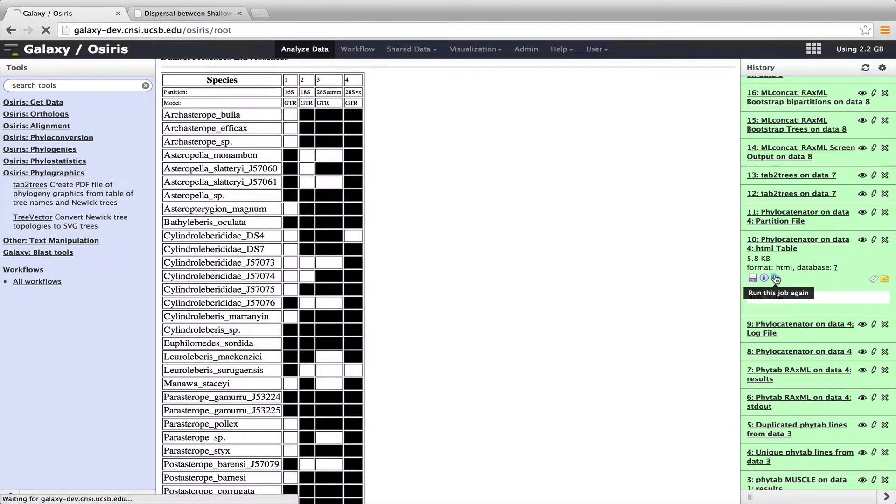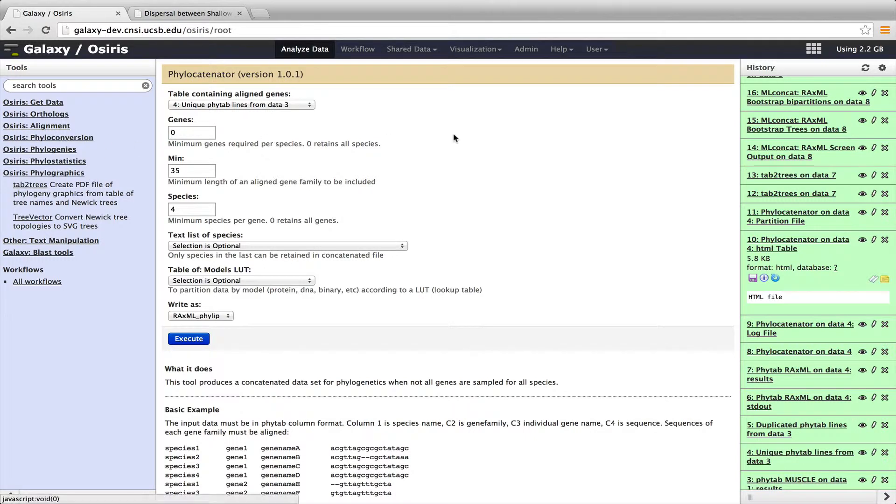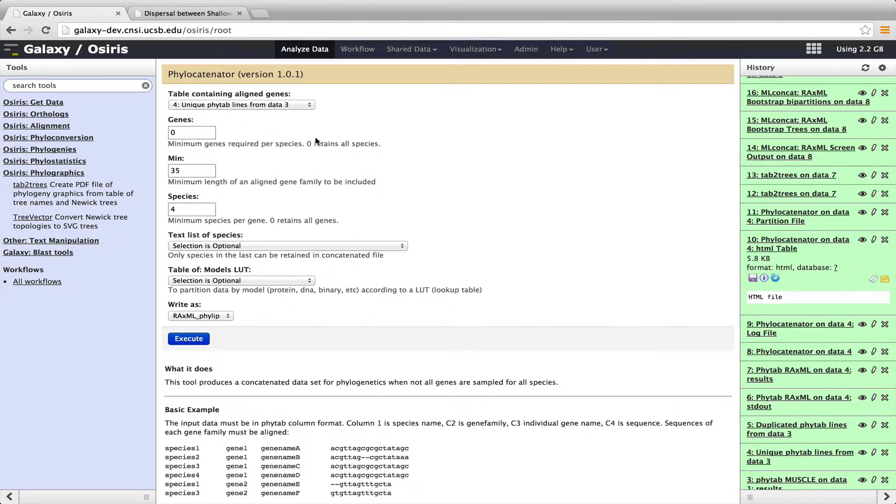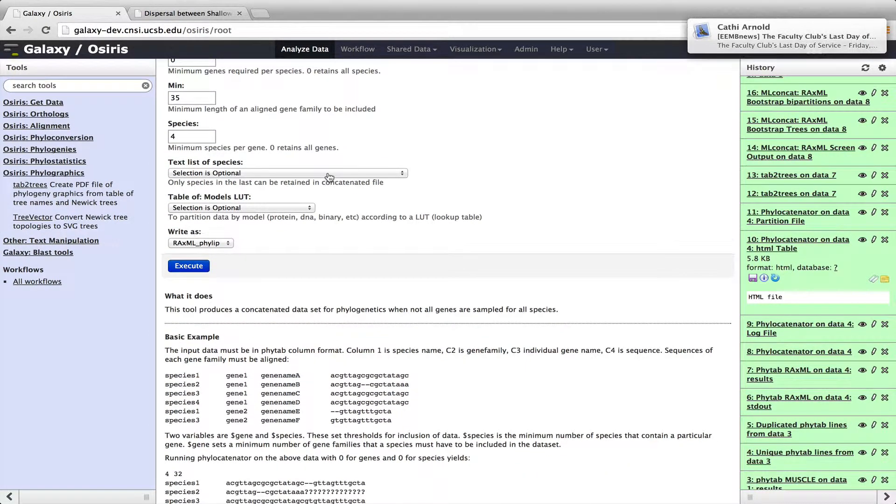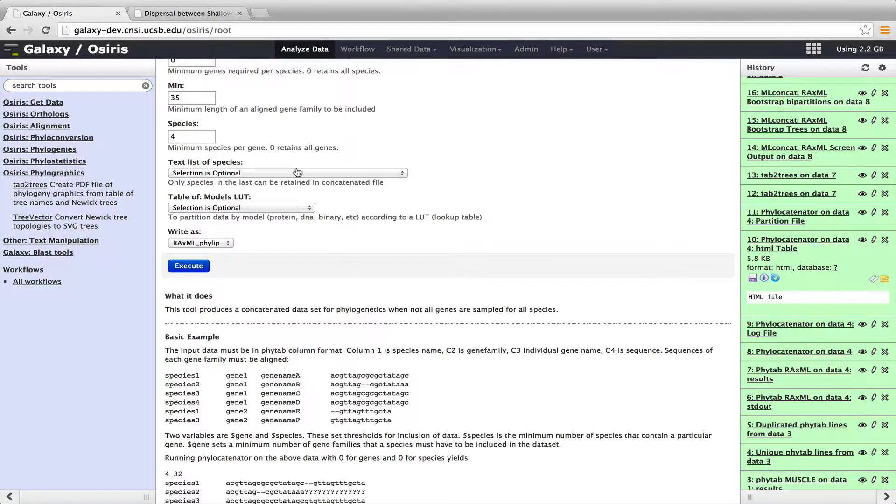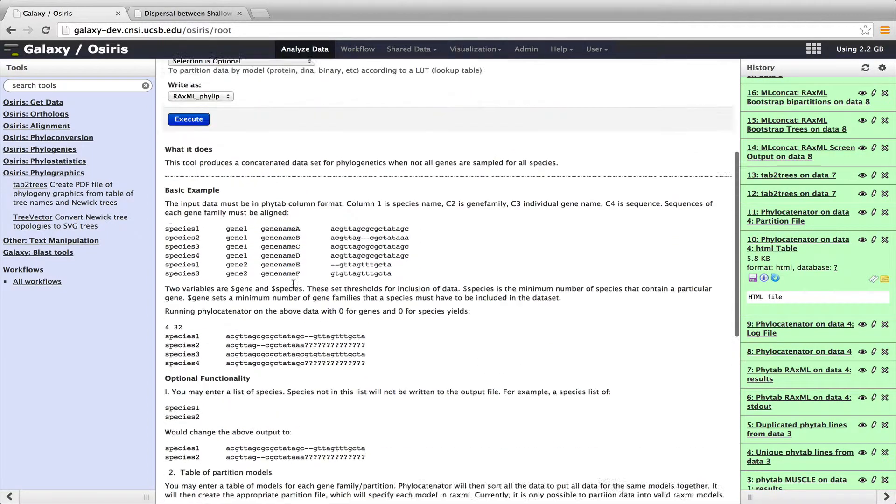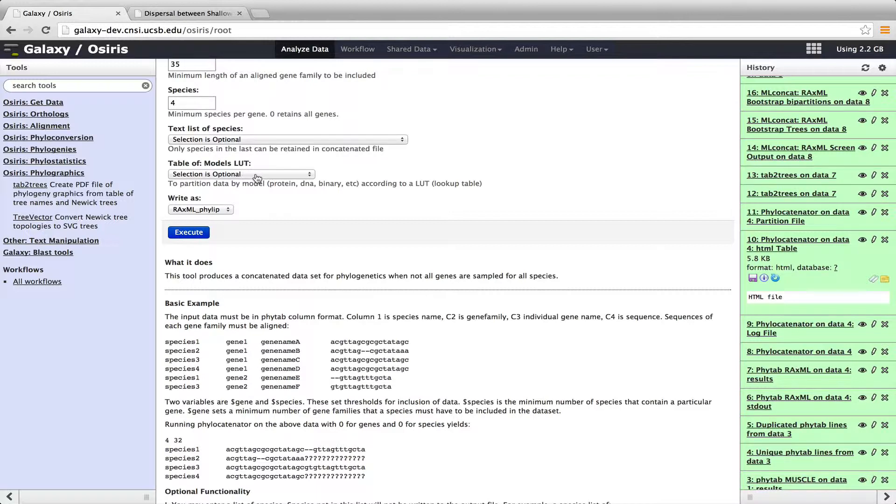Now, if we were to show what it looks like to run phylocatenator as a tool by itself, which we could always do here, we can see there's a few different options. In this case, I didn't require any minimum number of genes per species. But we can filter or we can titrate. We call it in our lab titrating the data set by forcing the data set to have more and more genes per species or more and more species per gene. And we can fill in those different values here. We can also force a minimum length of a particular aligned gene family. So that's the minimum number of amino acids or the minimum number of DNA sequences that must be present for a gene to be included. We can also put a text list of species here. So if we only wanted to analyze 10 of our species or a subset of our species, we can give it a list in a text file and pass that into the tool.